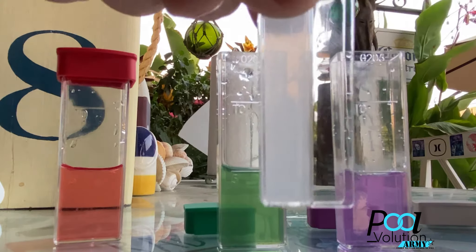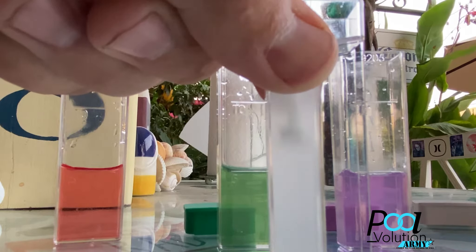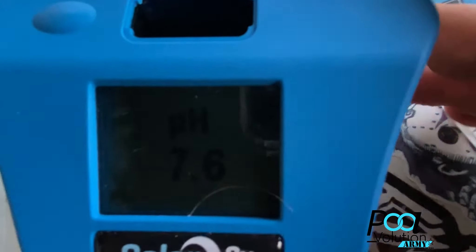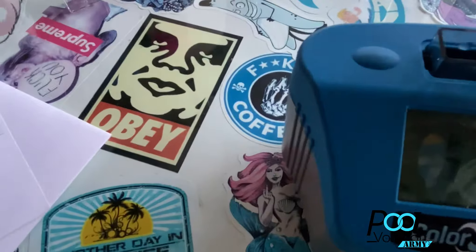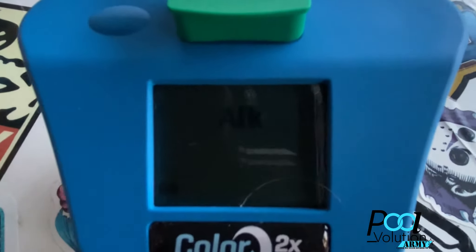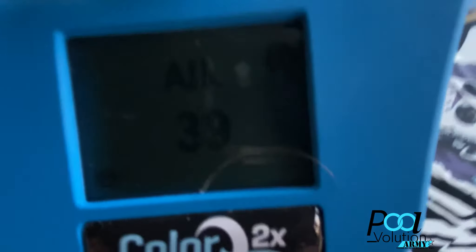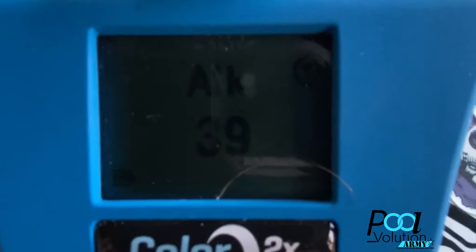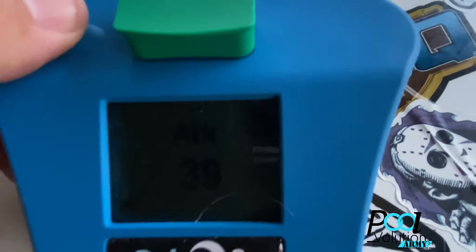Now we're going to do alkalinity — fair warning, my alkalinity is going to be low. I've been doing some tests with ORP and all kinds of different tests on my pool. My alkalinity is going to be low — and there it is. Don't tell anybody.